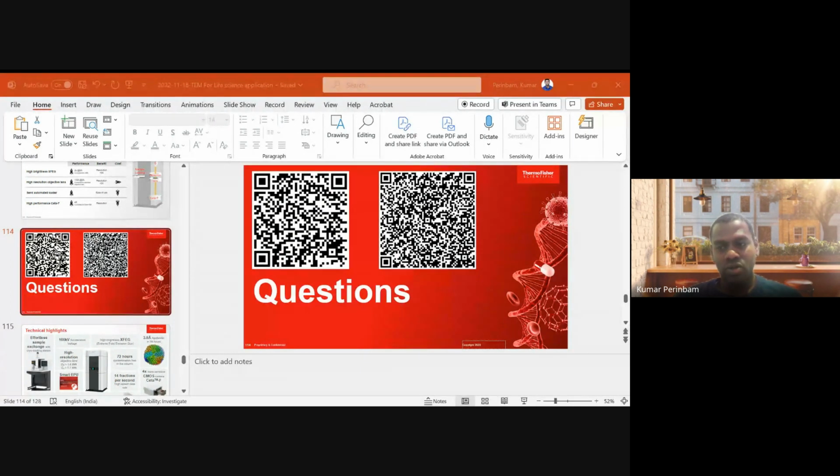There are also some very preliminary, basic studies going on at the quantum level, on how to manipulate the electron beams. That would be maybe in another 2 to 5 years, I can guess. That might improve the resolution, perhaps close to 1 angstrom or even beyond that. So that might be the future, I hope.